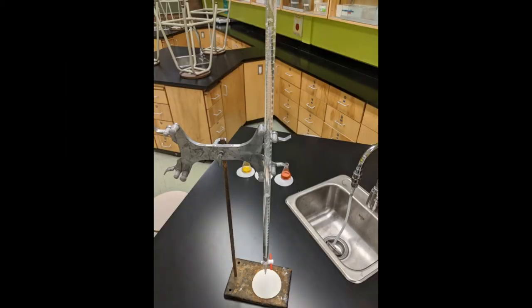This is our setup for the titration experiment. Here is our stand with the burette clamped in it — these just squeeze together to allow the burette to move up and down or to be taken completely out. The burette is filled with hydrochloric acid of an unknown concentration, which is what we are going to determine in this titration.